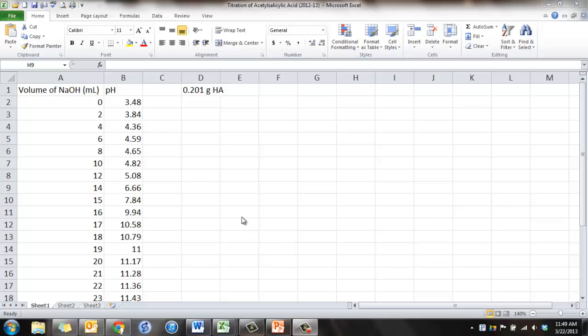Alright, welcome to a quick little flipped video on titrating an unknown weak acid. The first thing you need to do is create an Excel document and put your data in.